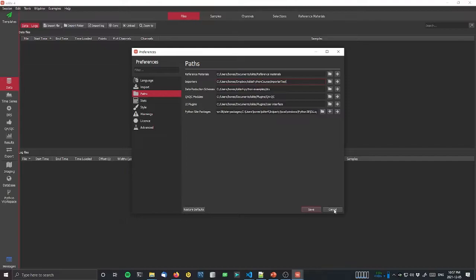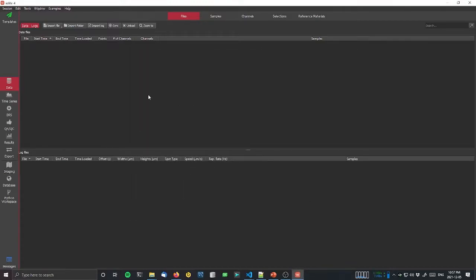This is especially relevant if you're writing an importer for something such as a CSV file where the two might be competing with one another. So with that, I think we're ready to start writing our importer.